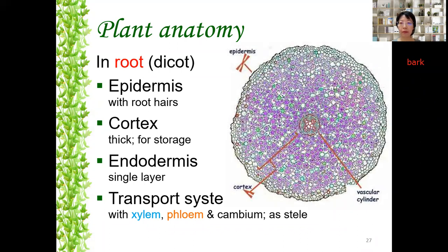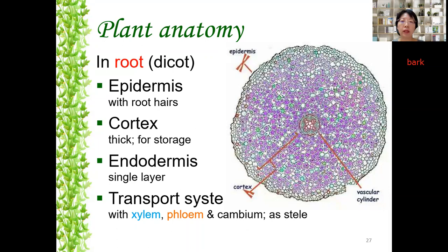This is a micrograph of a root. The epidermis is a tissue made up of sometimes one, two, or three layers of cells in the outer region. Then the cortex — the cells are irregularly shaped, quite big. Inside the cells you can see a lot of purple-colored structures, which are starch grains stored inside the parenchyma cells. Parenchyma cells are irregularly shaped, quite big, used for packing purposes, filling up space, and in this case storing starch. Right in the center is the stele, where the xylem is a four-pointed star and surrounding it is the phloem.